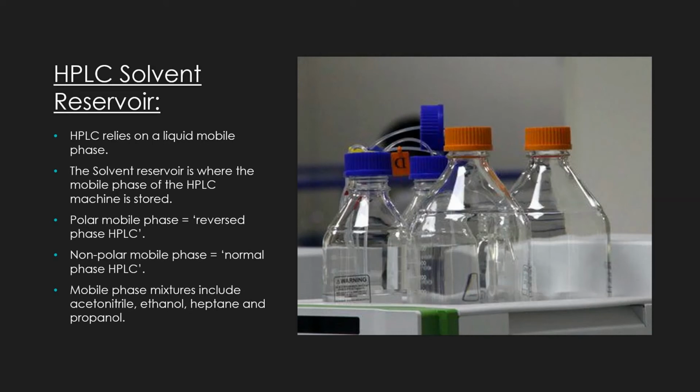The mobile phase can undergo two different elution modes, the first being isocratic elution, where the proportion of solvents in the mobile phase remains consistent throughout the analysis, whereas the gradient elution mode has a computer varying the solvent proportions throughout the experiment. These modes allow for greater resolution of analyte peaks to be achieved.